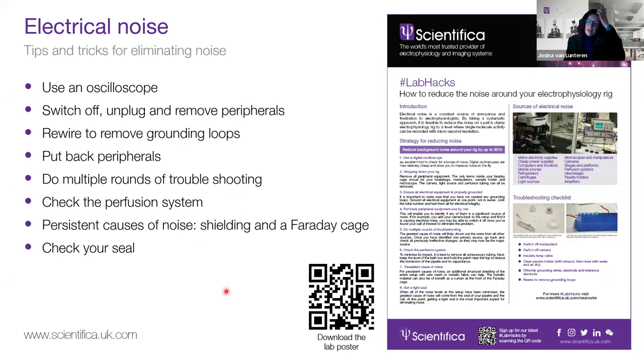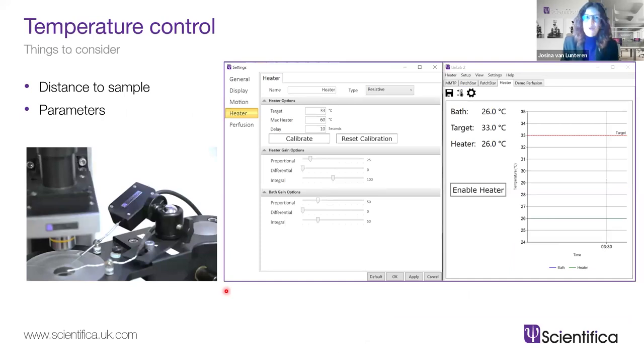Also check the pipette holder seals again — if they're not tight you could have small movement in the pipette, or the pressure could change. If you're approaching your cell and trying to make a seal and for whatever reason the seal isn't very good, you'll also see a lot of background noise in your recording simply from a poor seal. It's good to pay attention to whether that could be the cause.